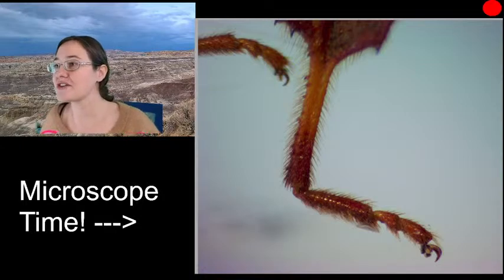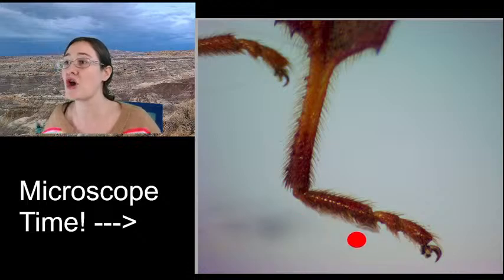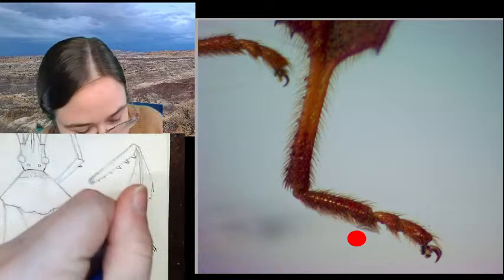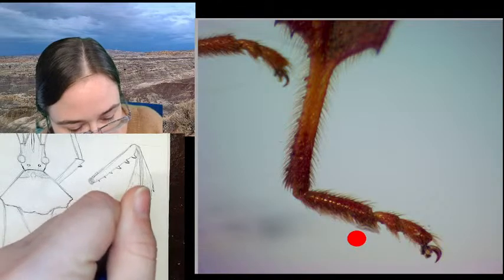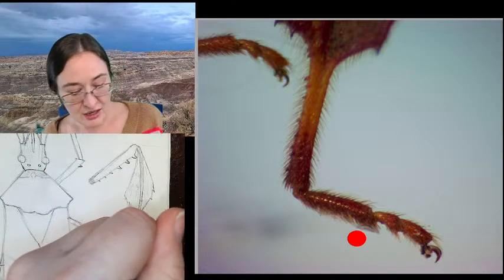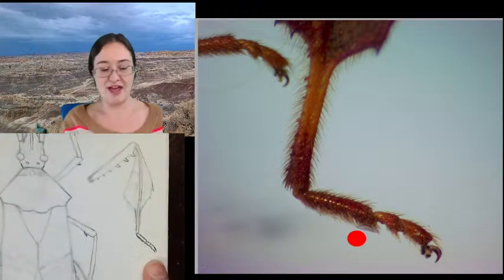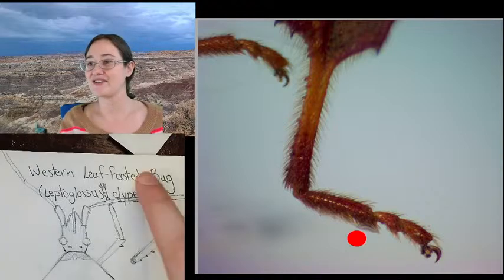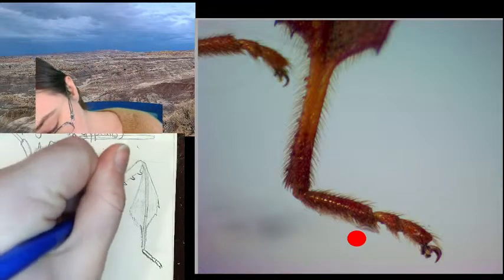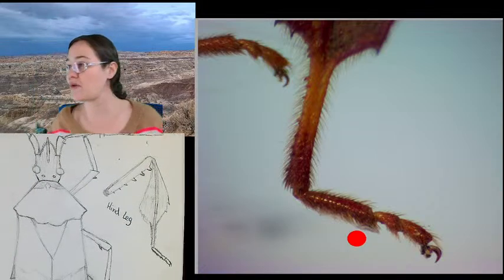All right, so these are the hairs that I was talking about, right about here, where you can see that they're very, very concentrated and almost like a comb. Those are going to help my friend stick. So if we wanted, we could add a little bit of texture by giving those hairs along the tarsal segments. We could add a couple hairs around that area, too. So we've got our leg. There's our name for our friend here. All right. So I'm just going to write hind leg next to that sketch so that we know what's up.